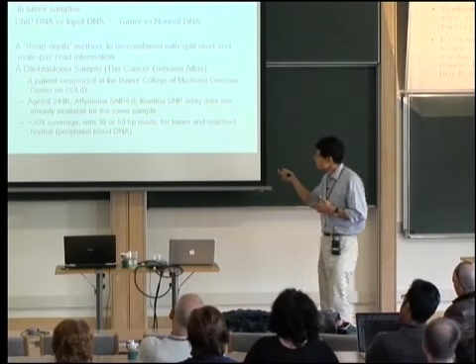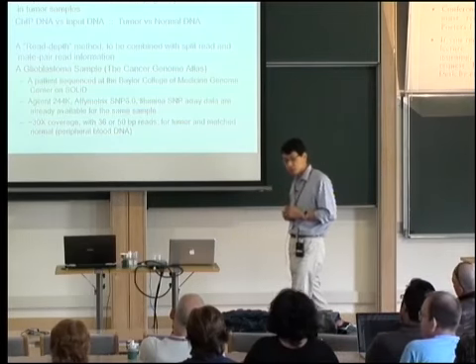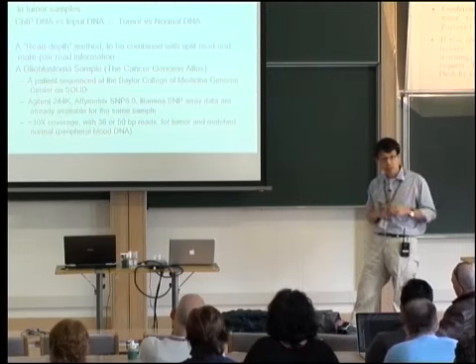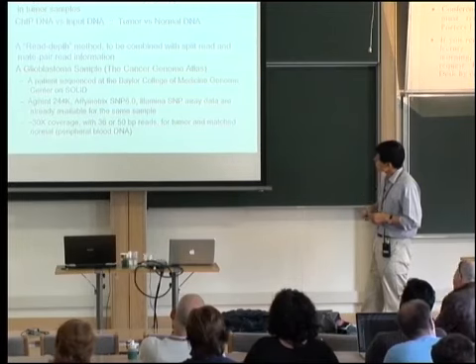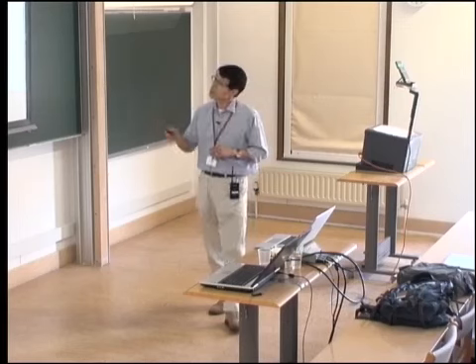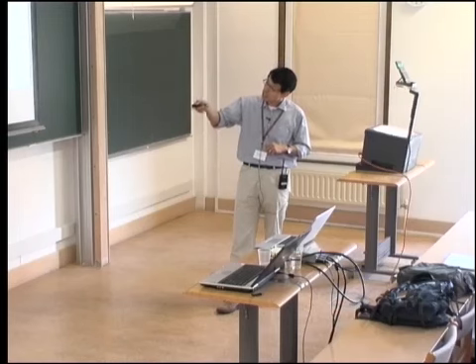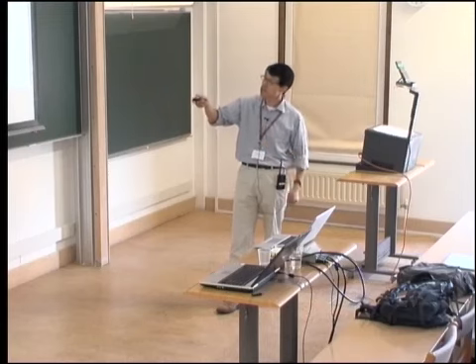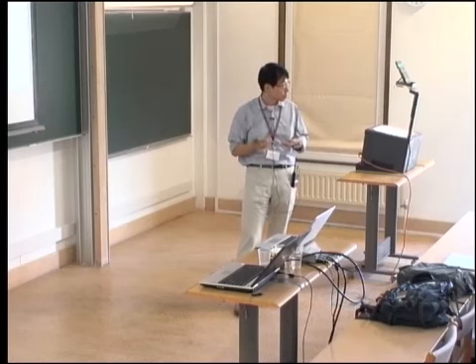The data set I'll talk about is actually just single end. I believe what happened with this sample was, well, first of all, it was done probably a year ago, but I think that the quality of DNA was such that they could not construct these mate pair libraries. So the sample that we analyzed is this glioblastoma sample, it's a brain tumor, from the Cancer Genome Atlas. And this was sequenced at Baylor on SOLiD and at 30x coverage. Okay. And the good thing about this was we could, in fact, compare this to Agilent 244 and SNP Affy 6.0 and Illumina array because they had been done as part of the pilot TCGA project.